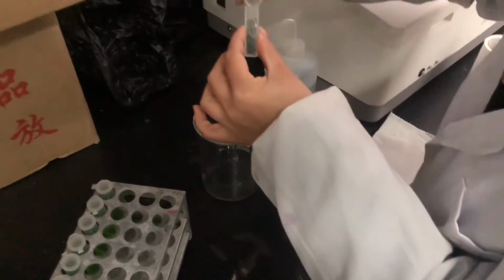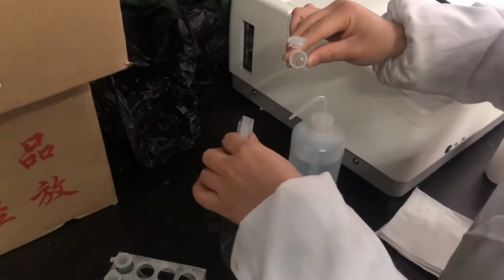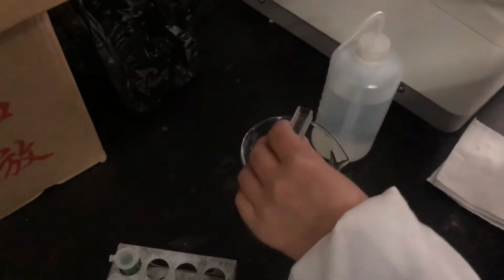We pour some. Do you know what this is about? Okay. You know this? Yes.